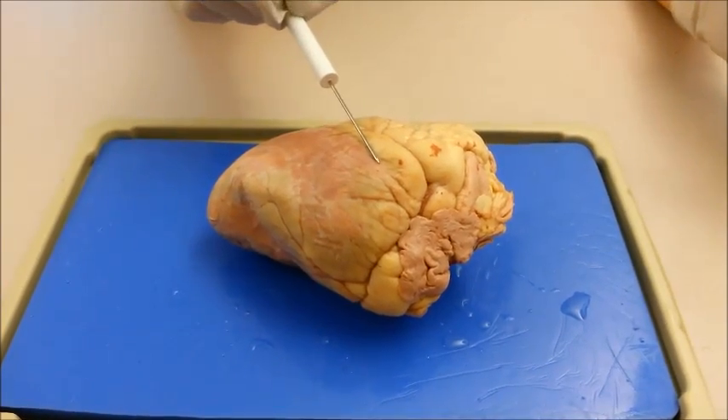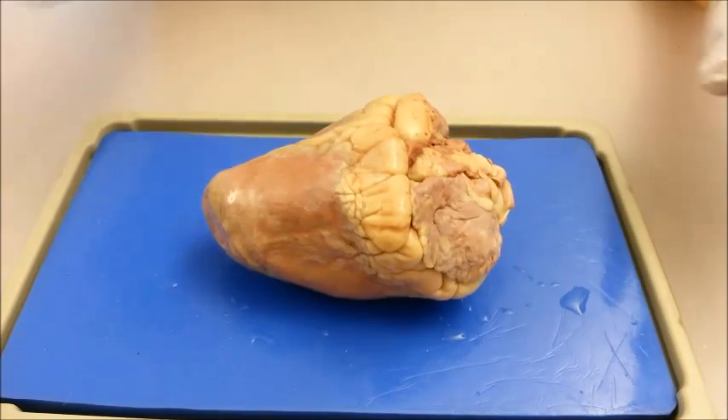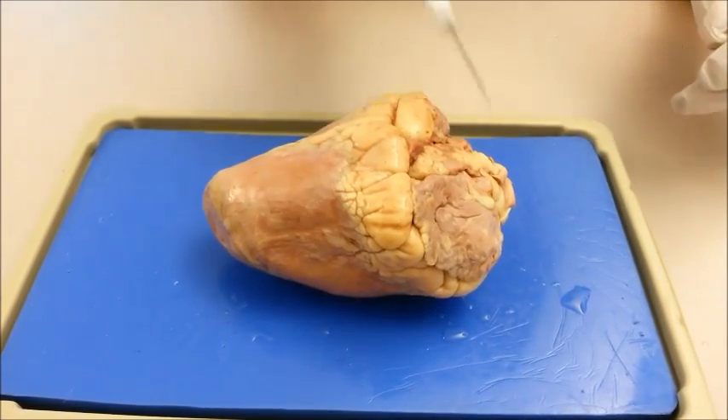Here is the anterior position of the heart. If you flip it over, that will be the posterior side. Then there is the superior and inferior parts of the posterior side.